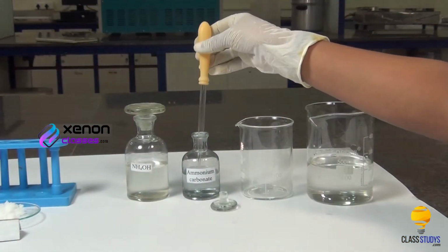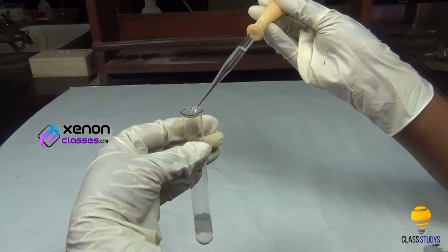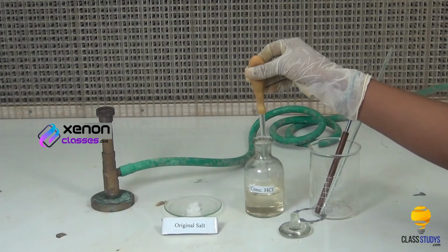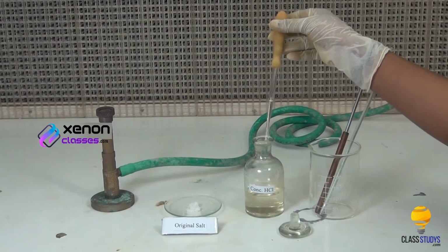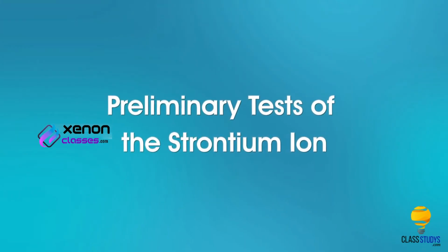In group 5, strontium ions are precipitated as their carbonates by adding ammonium carbonate to their solutions. Our aim here is to test for the presence of strontium ions in a given salt. First, we look at the preliminary tests of the strontium ion.